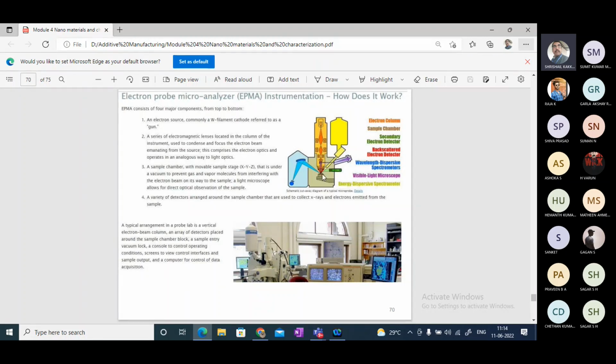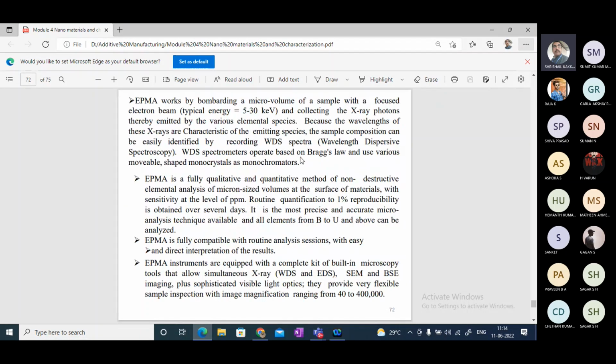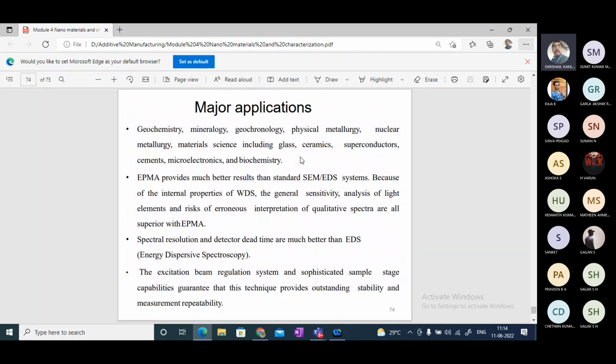Okay, and at the point of interaction, the specimen will be kept here and it will be magnified, and it works based on the wavelength. Due to this wavelength, the light will be dispersed and give a spectrum output. A spectrum output will be given in magnified form, and it can be used for analysis purposes. Okay, and if any doubts are there, please ask me.